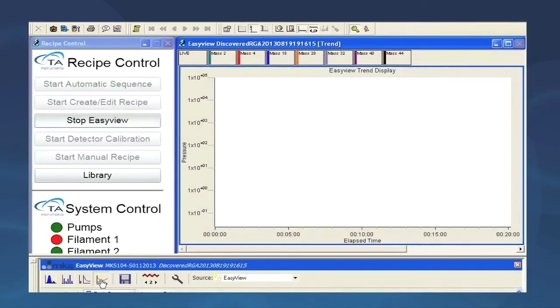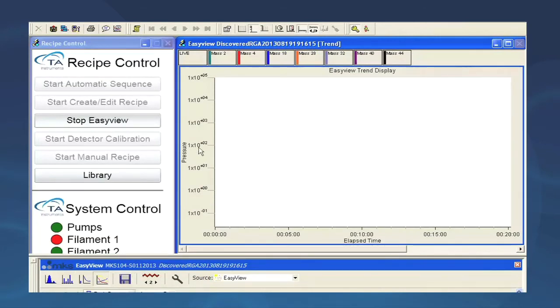Enable the peak jump trend mode by clicking on this icon. You will see a plot of the total pressure versus elapsed time. Notice that several ions are selected by default and these are the ions associated with the atmosphere.